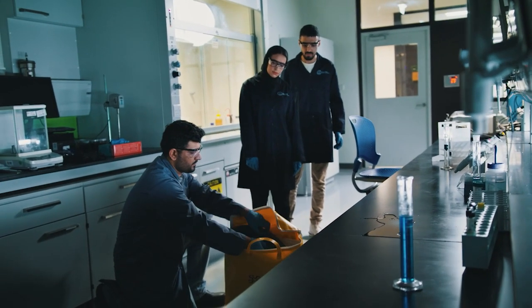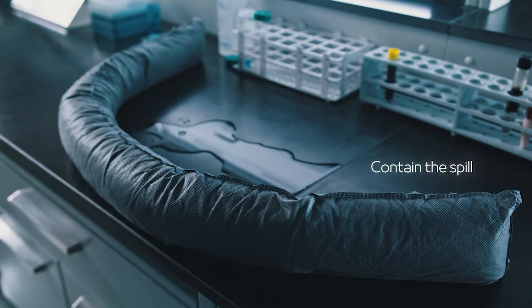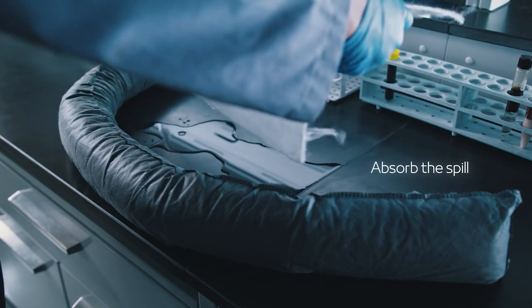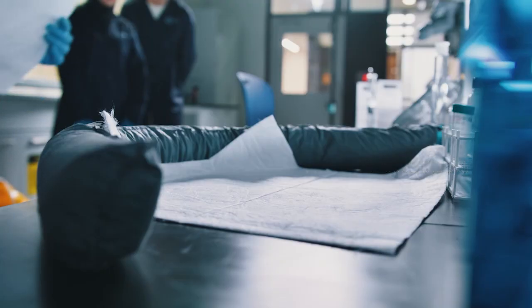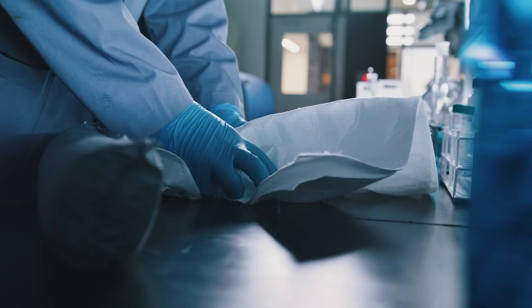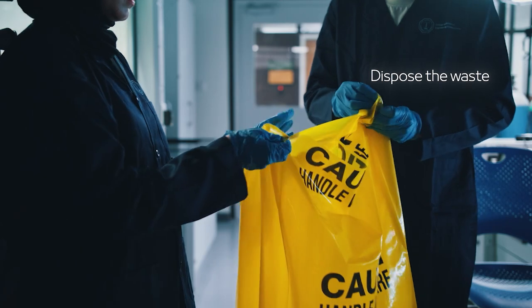Spread the pads out in a semicircle to contain the spill. The pads work as a dam wall. It is essential to containing the spill immediately. Apply layers of mats over the spill to effectively cover it. The mats will absorb the liquid spill. Once the mats have absorbed the spill, utilize other mats to clean up the residue. The used mats and pads must be disposed of in the plastic bag that comes with the spill kit. Place a label on the bag and send it to the waste chemical storage area.